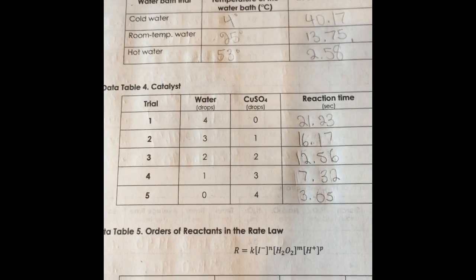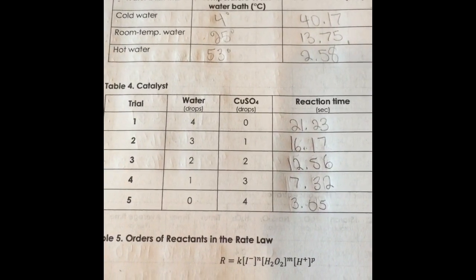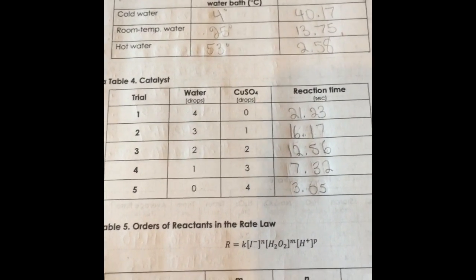For the reaction with copper 2 sulfate, I saw a decrease in reaction time as more drops of copper 2 sulfate were added.